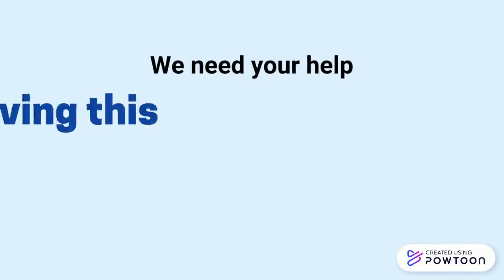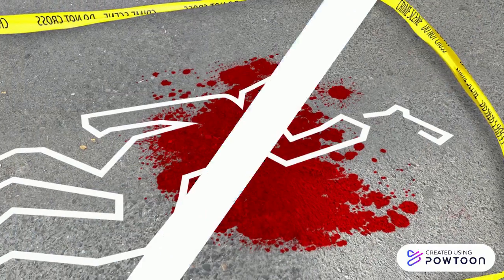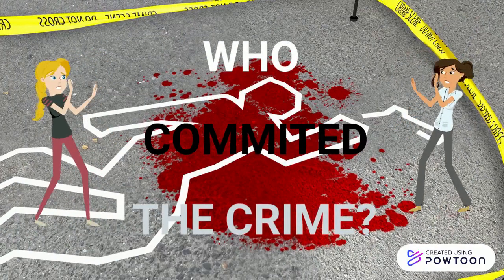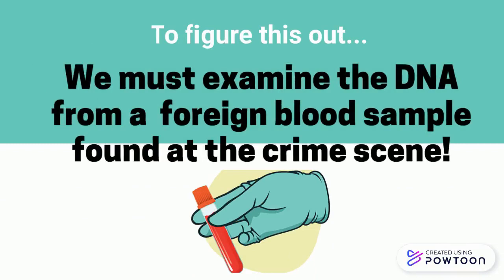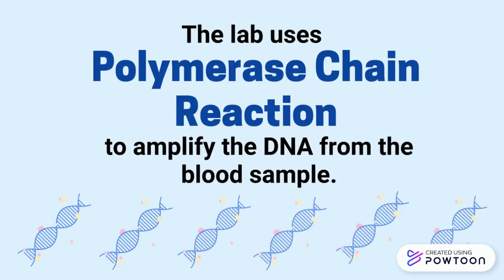We need your help solving this mystery. To figure this out, we must examine the DNA from a foreign blood sample found at the crime scene. The lab uses polymerase chain reaction to amplify the DNA from the blood sample.